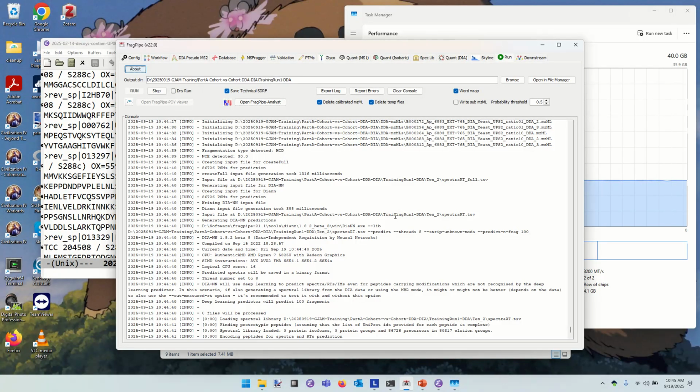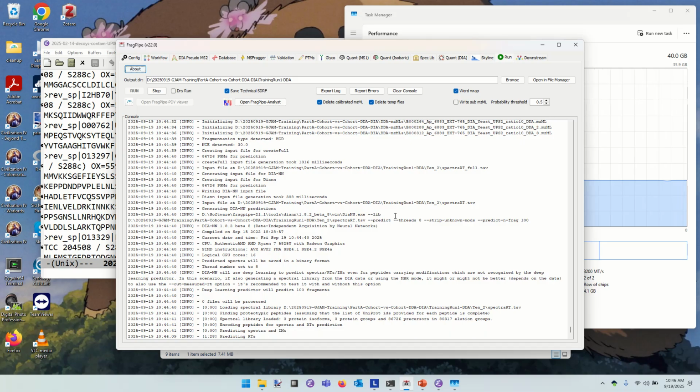Seems to be a lot of resource issues. So yeah. I have to say that as a bioinformatics person, trying to gauge what kind of hardware your users have access to is a very difficult thing to do. When MSFragger was first developed, somebody with 16 gigs of RAM had something special, but not anymore. And they just expect that you're going to have a fair bit of RAM on the computer.